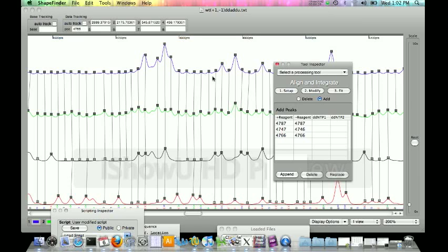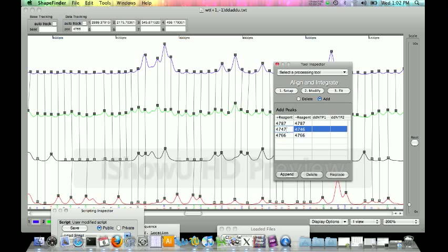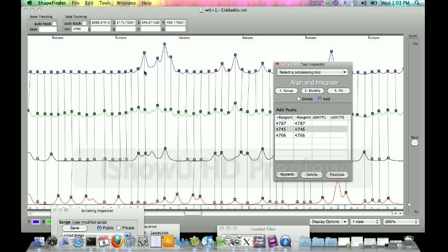What you can do now is go into this Excel tab sheet here and you can adjust the positioning of those peaks themselves. Right now it's at 4747, but we'd want it to be a little bit more to the left. So I'm going to make it 4745. We'll hit enter, hit append, and there you go. Shifts it right up to the top of the peak there.